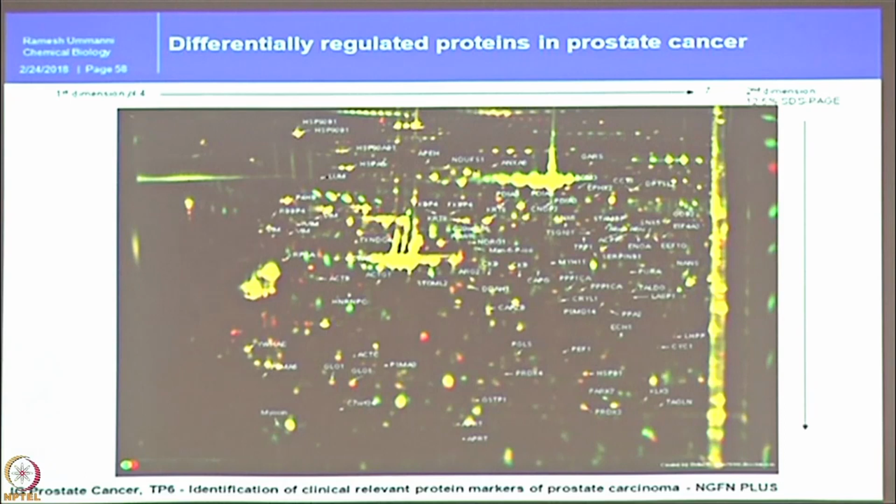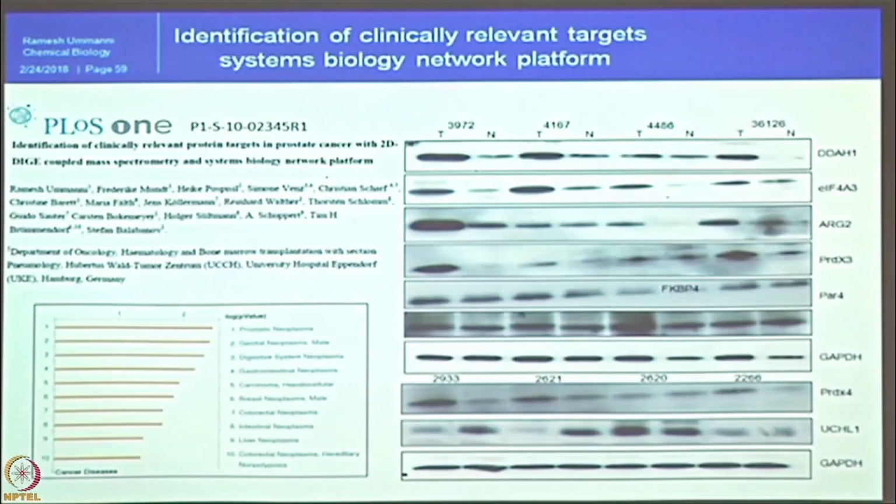I wanted to analyze and establish the signature from the same set of samples, right. So, this network platform we built using a systems biology based approach, and we enriched the marker analysis using software tools and known information. These are the different targets I have highlighted to proceed forward. This list is also not small. So almost 10 proteins are there to proceed forward.